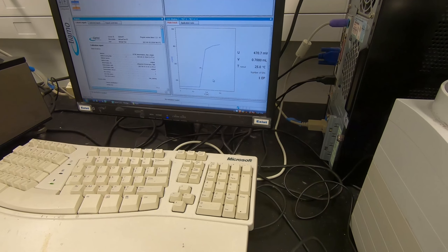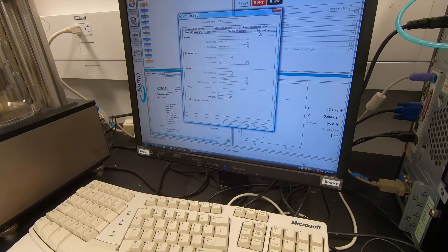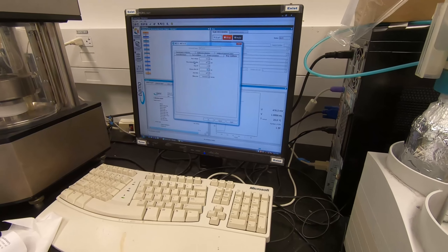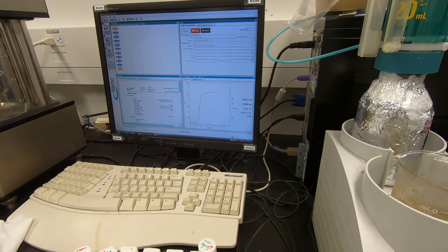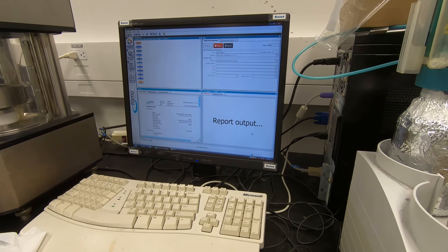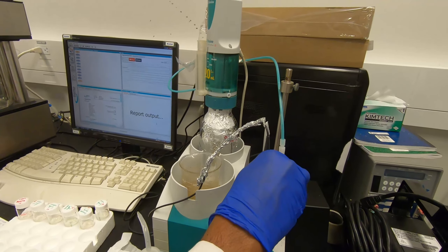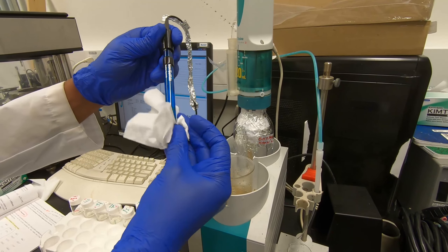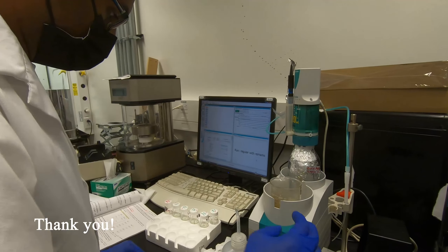We already set the stop condition to let it run another 1 ml after the end point, then it will stop automatically - no need to worry about stop volume. It should stop at about 1.4 ml. Now it's done. Remove the electrode, clean up, put the calibration standards back in the cabinet. Copy the number and calculate the results. Thank you - I'll end the video now.